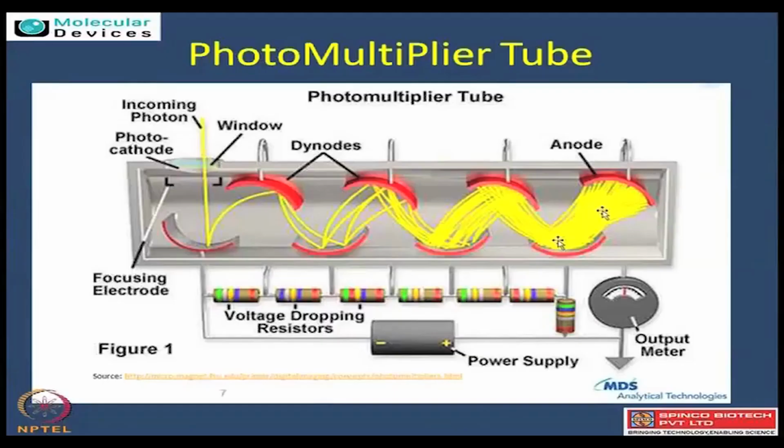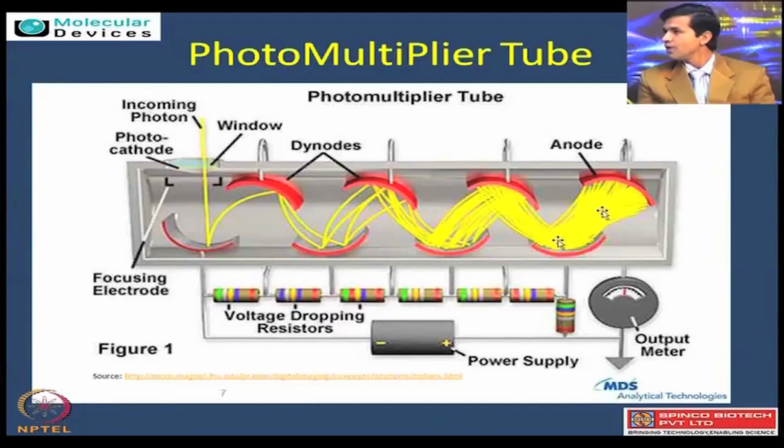Essentially, the data could range right from 0 intensity, which is equivalent to the background, to the very highest intensity. So the best way to control the variations is looking at the photomultiplier tube. Actually, that is nothing but once you do a fluorescence, the intensity comes out of that. So the very low expressing genes or proteins will give you very low fluorescence intensity, whereas the high will give very high.